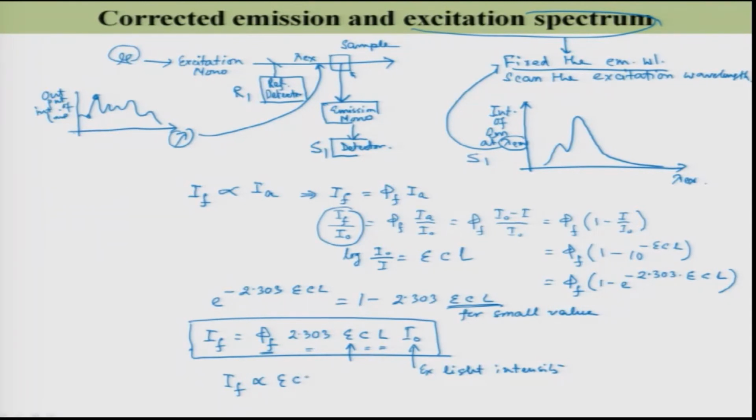So it is proportional to A, and that means this is my excitation spectra.